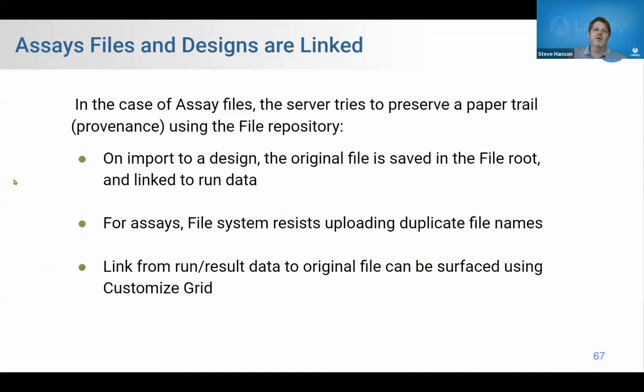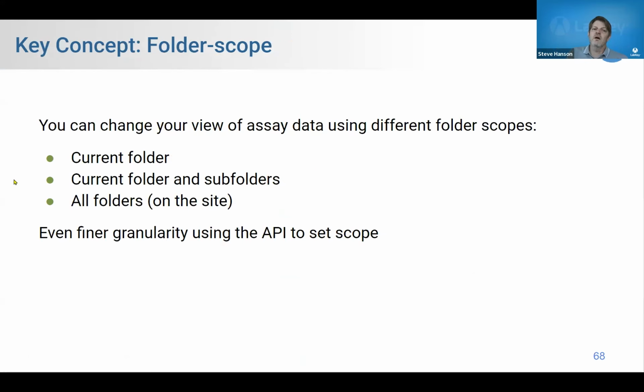So another thing, we've seen that files and designs are linked. Here is a concept I want to get across. I'm going to try to return to this concept every day, and that's the idea of a folder scope. This is something that assay designs take advantage of.